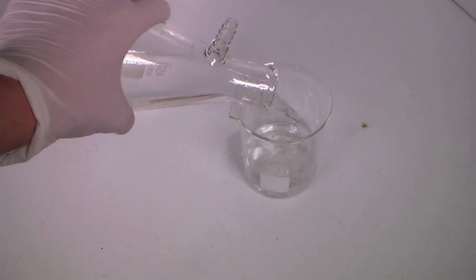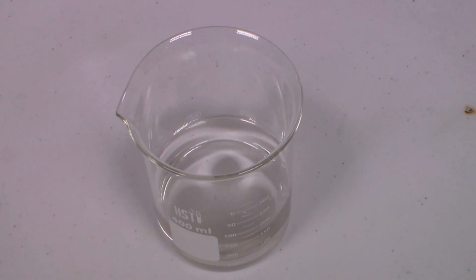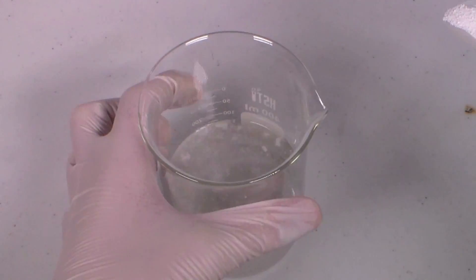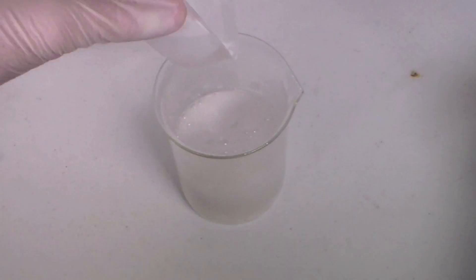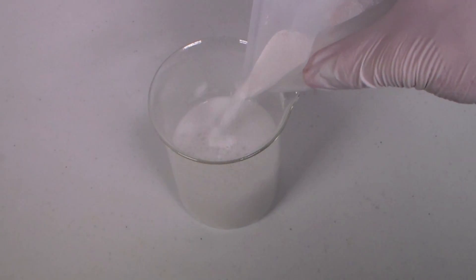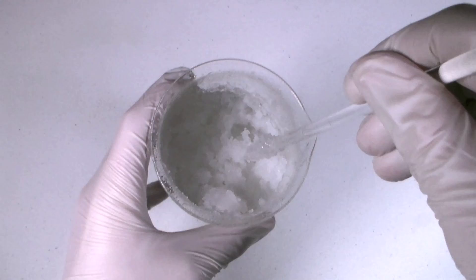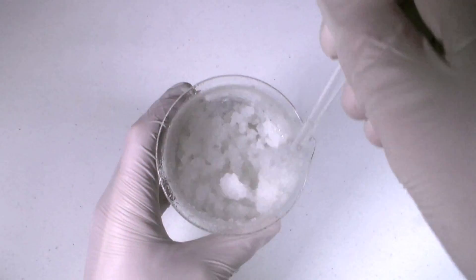Now we're ready to convert this aluminum chloride into aluminum oxide. To do this, slowly add the sodium carbonate to the aluminum chloride solution. Carbon dioxide gas will be released, and aluminum hydroxide will precipitate out as a gelatinous solid. We are using an excess of sodium carbonate to ensure that all of the aluminum chloride reacts. As you can see, the suspension is really thick and gelatinous, and so filtering it would take forever.